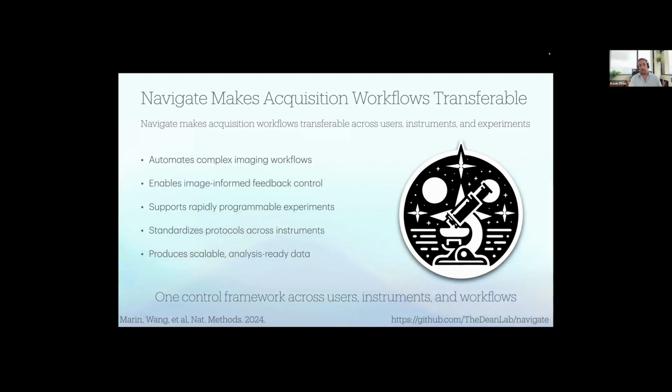It's all very programmable, and you can do this with a GUI interface so that those who may not feel confident in their programming capability can literally just drag boxes around. And the hope is now we have a unified system that can standardize protocols across instruments. So you might develop a smart imaging workflow, and then you can plug and play it directly into another microscope and leverage that.